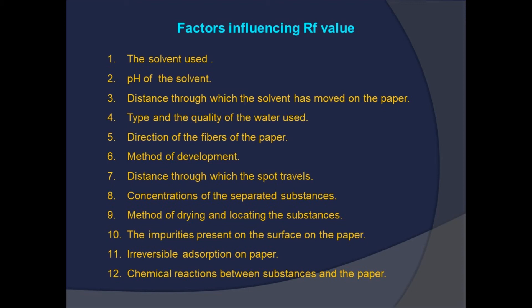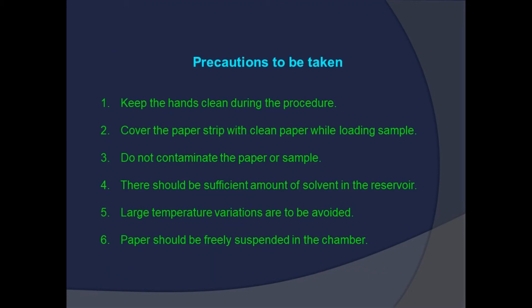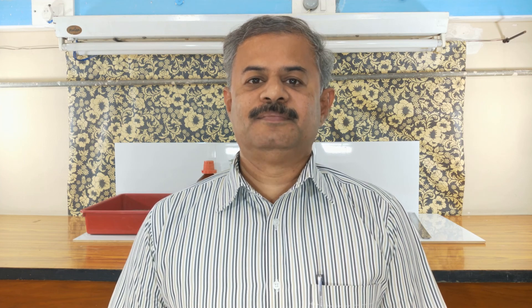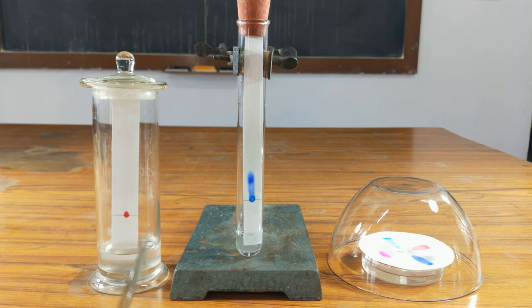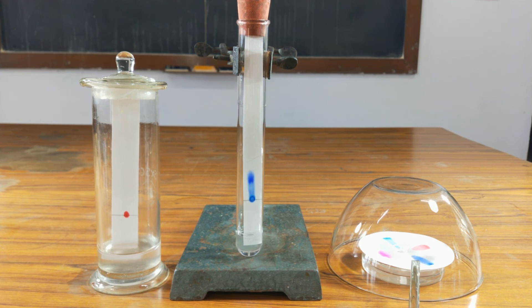We must take some precautions: keep the hands clean during the procedure, cover the paper strip with clean paper while loading the sample, do not contaminate the paper or sample, ensure there is sufficient solvent in the reservoir, avoid large temperature variations, and make sure the paper is freely suspended in the chamber. For ascending and circular paper chromatography — ascending is done in a specimen jar or boiling test tube, and circular chromatography is kept on a Petri dish and covered with a glass bowl to avoid evaporation of solvent.